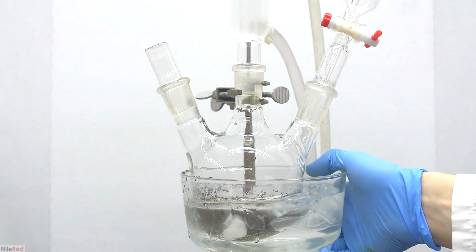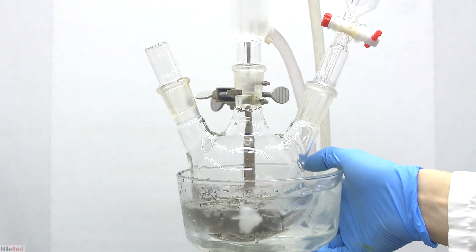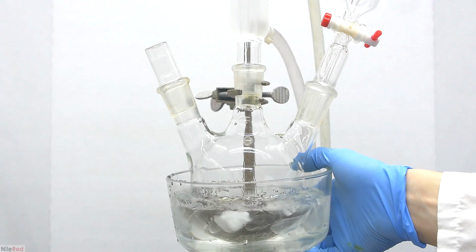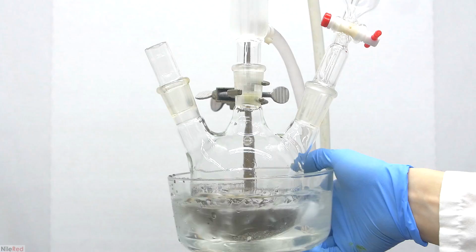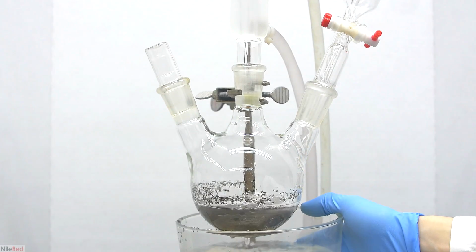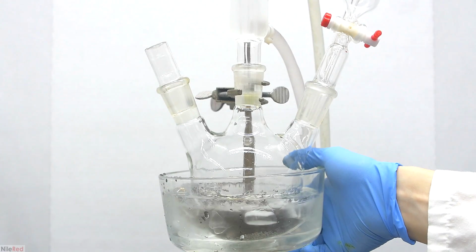It's very important in this step that you don't keep the ice bath on it too long, though, because we can cool it down enough that the reaction stops, and we sabotage ourselves. When we take the ice bath off, though, the reaction might start to get much more vigorous again, so it's just going to be a cycle of icing things, taking the ice bath off, icing things again, over and over until the reaction's done.